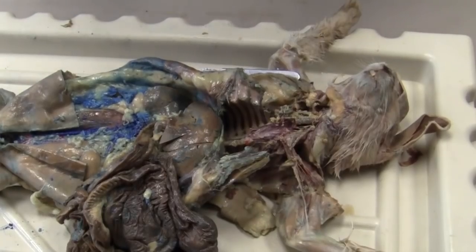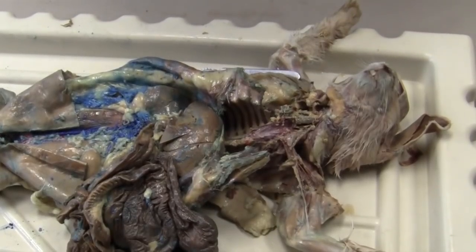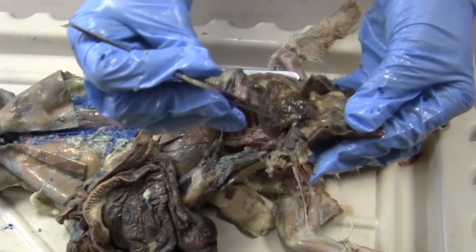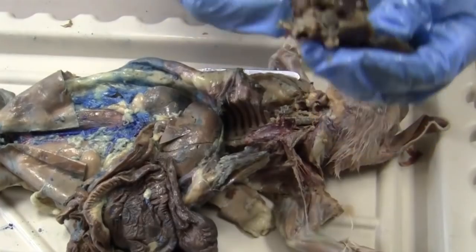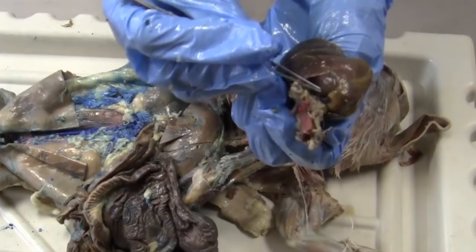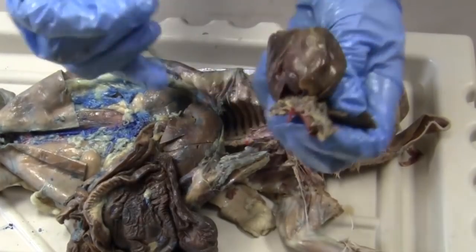I also want to show you, and if you take off the pericardium, it may make it a little easier for you to see the entrance where the cranial and caudal vena cava actually meet into this right atrium of the heart. So cranial vena cava, caudal, meeting into this whole right atrium of the heart. Then I have the right ventricle, left atrium, left ventricle of the heart.